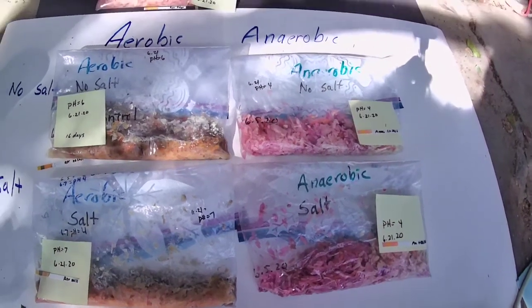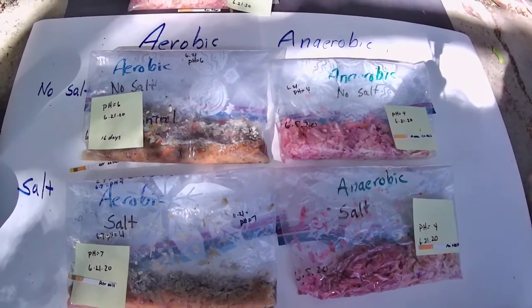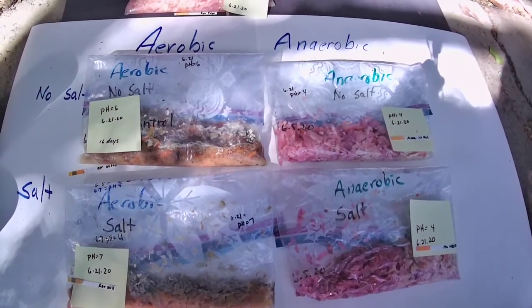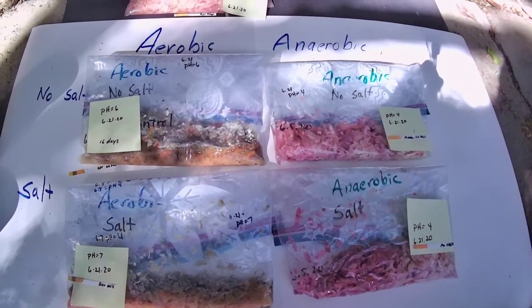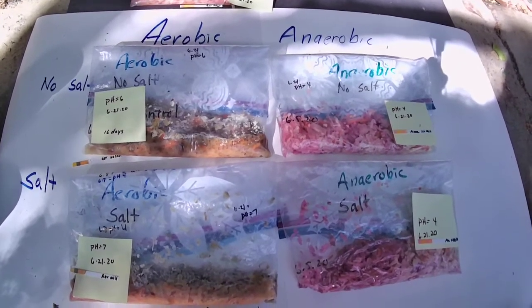Hi micro folks, this is one of the final videos for our cabbage fermentation experiment. This is now day 16, so over 2 weeks after we started the experiment. So we're just looking at physically how our different cabbage treatments appear.